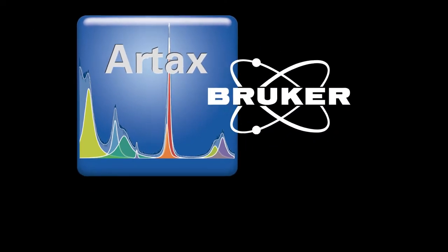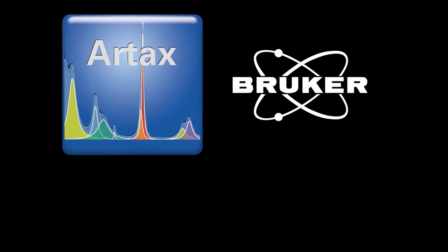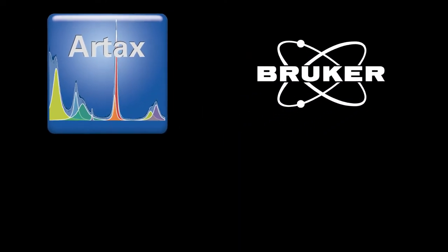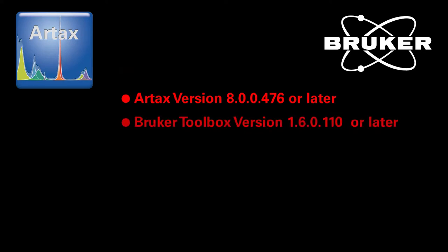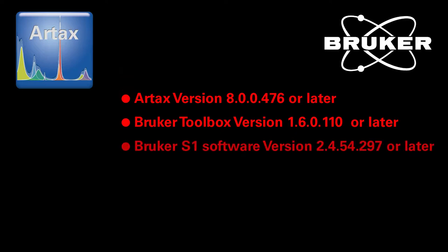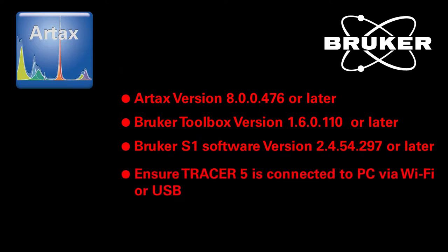Hi, I'm here to explain how to use RTAX to acquire and analyze a set of data. Our beginning assumptions are that you have RTAX version 8.0.0.476 or later, and Bruker Toolbox version 1.6.0.110 or later installed on your PC, and you have Bruker S1 software version 2.4.54.297 or later installed on the instrument. Finally, we assume that your instrument is connected to the PC.